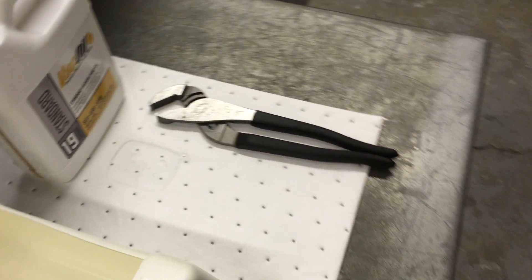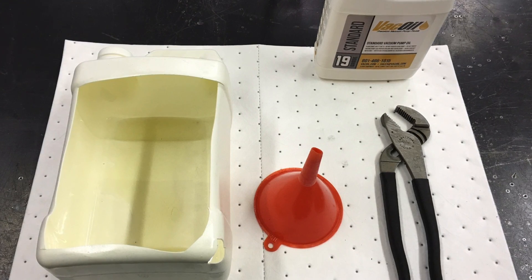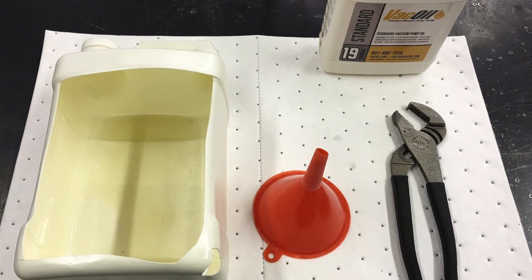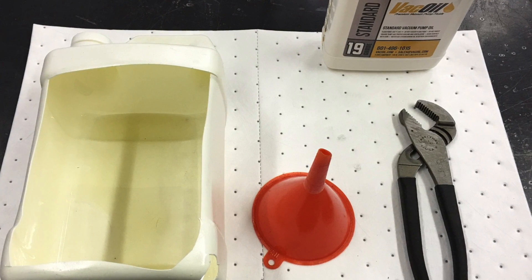To change your oil you will only need a few items: an oil pan or any makeshift container to capture the vacuum pump oil, a channel lock wrench, funnel, and some absorbent pads or rags to keep the area clean and to clean parts from old oil.